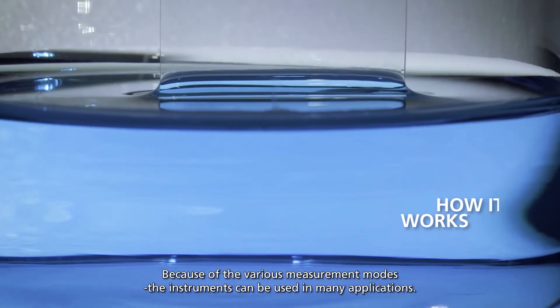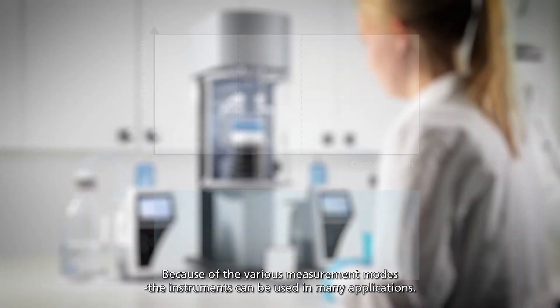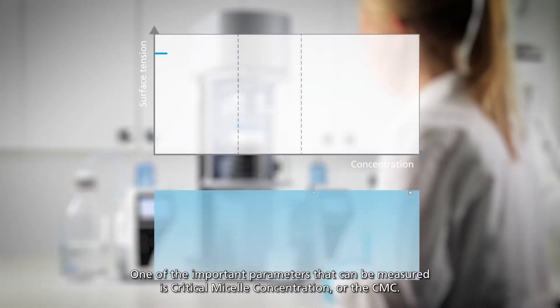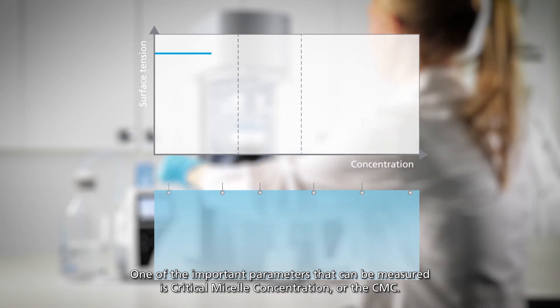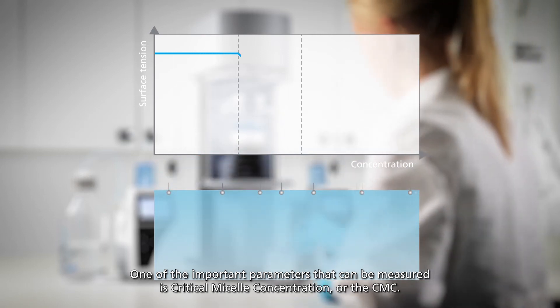Because of the various measurement modes, the instrument can be used in many applications. One of the important parameters that can be measured is critical micelle concentration, or the CMC.